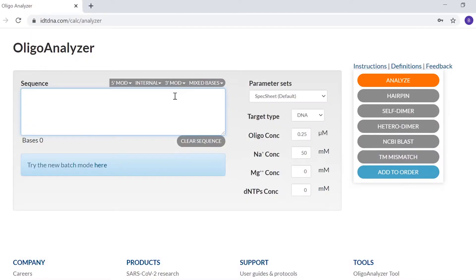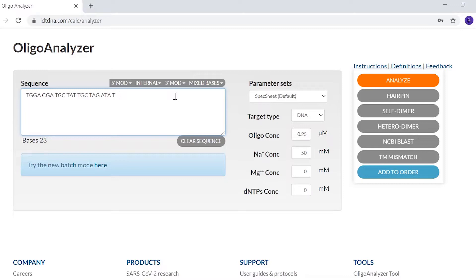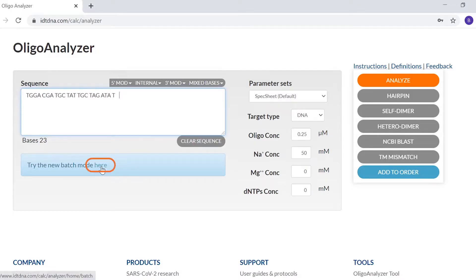For the first step, type in your sequence, or cut and paste in from another source, in the 5' to 3' direction. Batch entries used to enter sequences in FASTA format or an Excel file. Batch entries will provide you with select physical properties of the sequence, such as melting temperature.